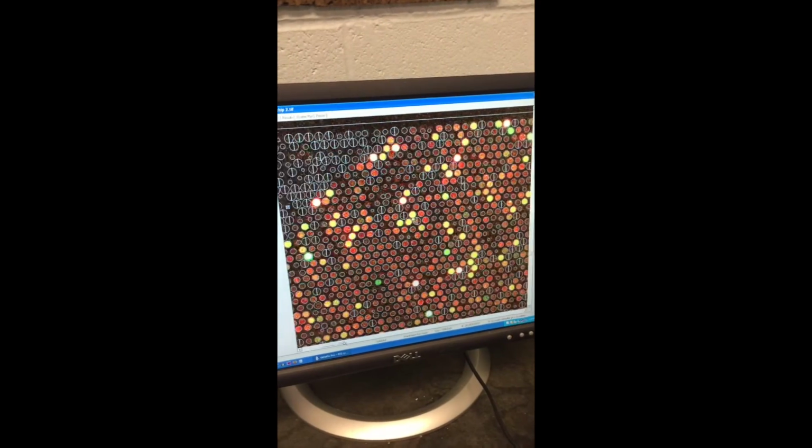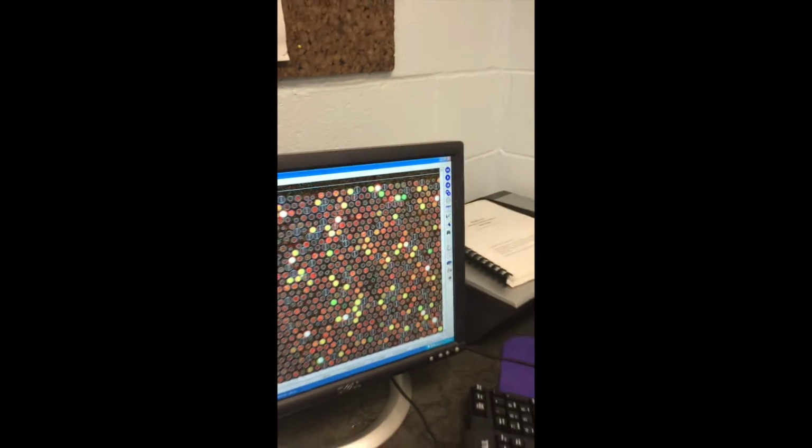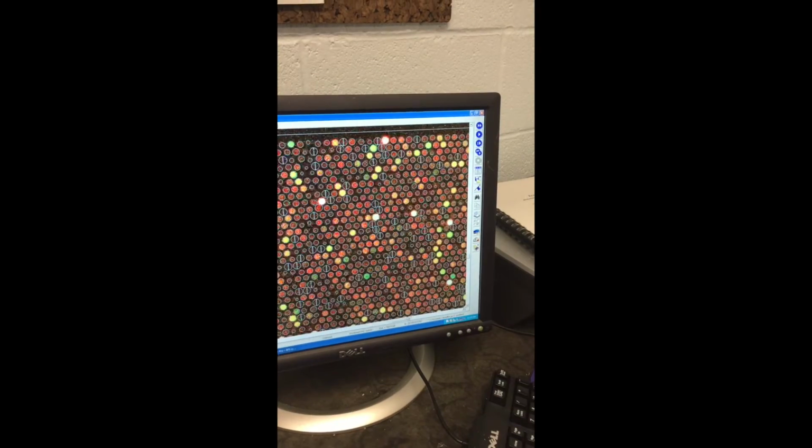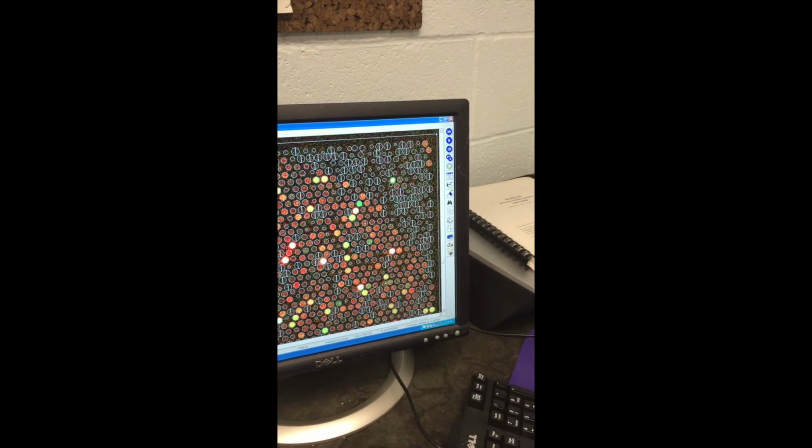So you can do all sorts of things like that. My opinion is the statistics will usually clean this all out. Even if it flags something that it shouldn't have been flagged, I'll have the signal intensities, and if it's consistent, it'll be statistically significant. If it's not consistent, then it's going to be washed away anyway. So having perfectly nice chips makes the statistics very easy to do. And sometimes you might want to throw out an array that doesn't look as good, just because it's going to ruin the statistical analysis. But when you have a beautiful chip like this, that's the way to go.